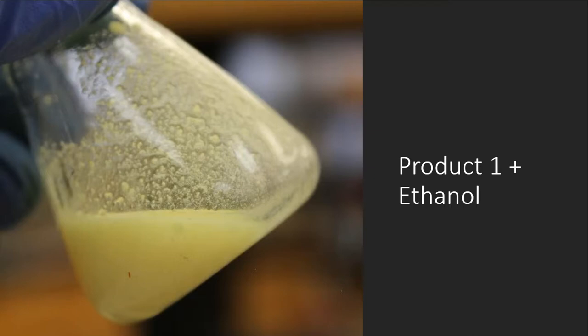And when I add ethanol, folks, this is what it looks like. Again, you can make your observations the way that you need to. Did it fully dissolve? And the answer is no. Well, I can't recrystallize if it doesn't dissolve, then it's not called recrystallization. The object here is for me to add ethanol to get the crystals to dissolve and then allow those crystals to precipitate back out. That is what we're after here, and that is not working for me.